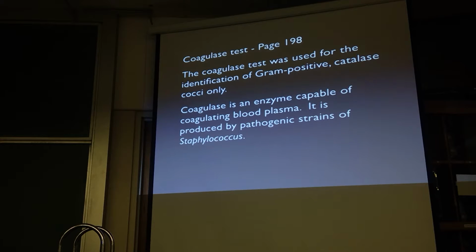They're orange. They have a C on the top for coagulase. This was used for cultures that were gram-positive, and they were originally on mannitol salt agar. So not everybody had this test, but you need to know about it anyway. Coagulase, notice the ASE ending? That's an enzyme. What do you suppose a coagulase enzyme would do?